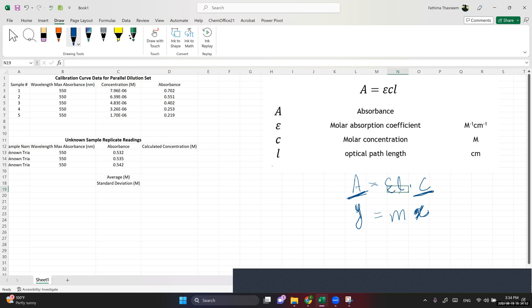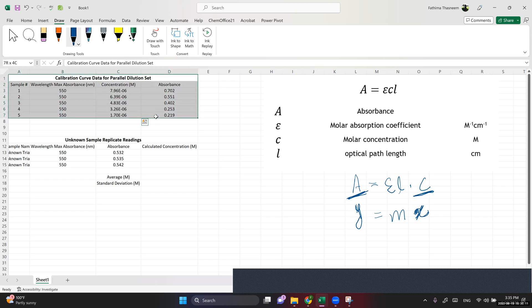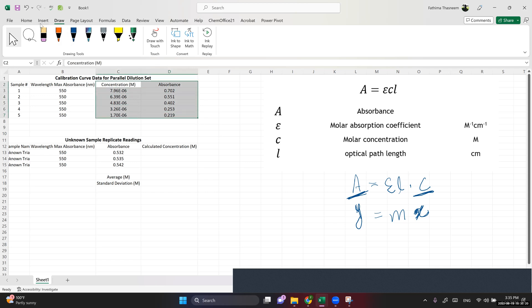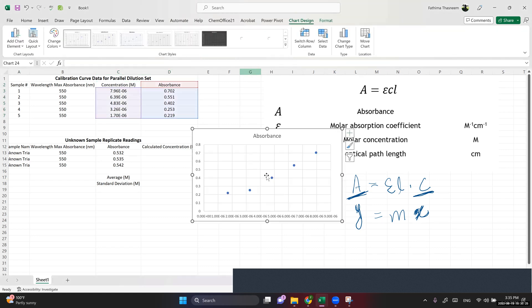I have a dataset where I made a dilution series with different concentrations, measured them in the spectrophotometer, and got absorbance values — so I have a set of x and y data points. To draw a plot, I select the data, go to Insert, choose Scatter Plot. Now we see that automatically my x-axis is concentration and y is absorbance.